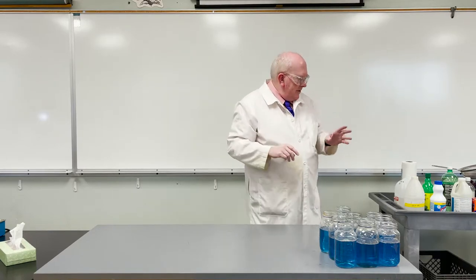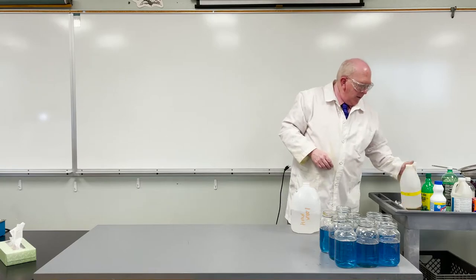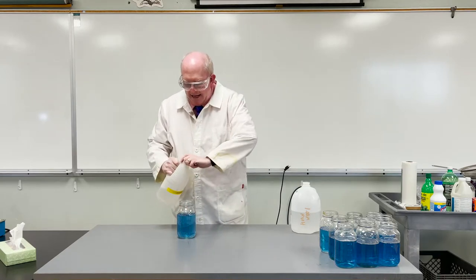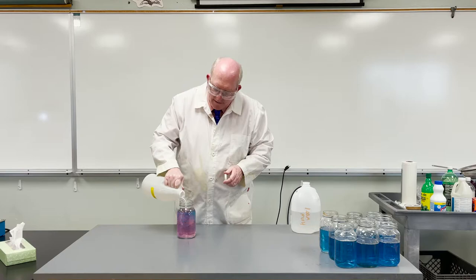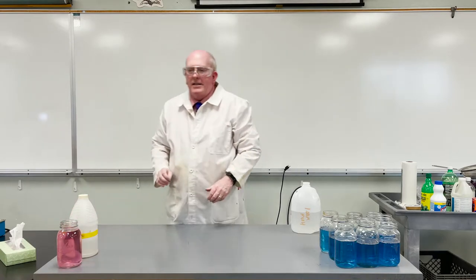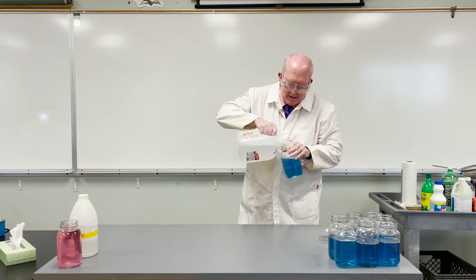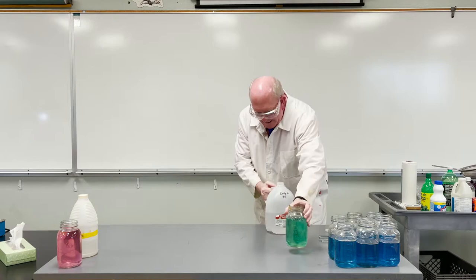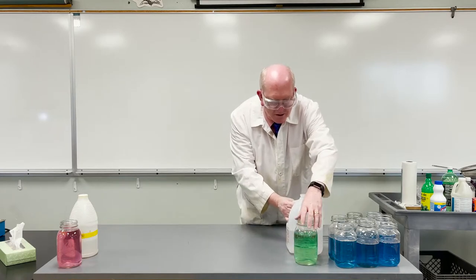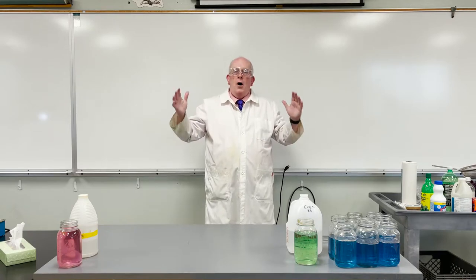To set my standards, I have one molar sodium hydroxide, which is a base, and one molar HCl, which is acid. So first, let's add a little bit of acid to this full-range indicator. It's gonna be pinkish in acidic solutions. This is the base — take some of that. It's gonna be greenish to bluish in basic solutions. So what this has enabled me to do is put reference points on my pH scale.